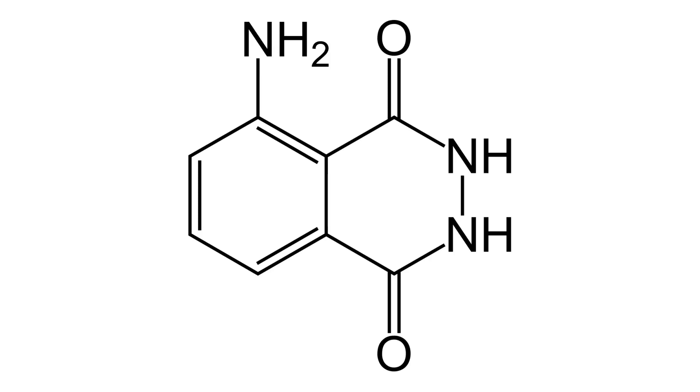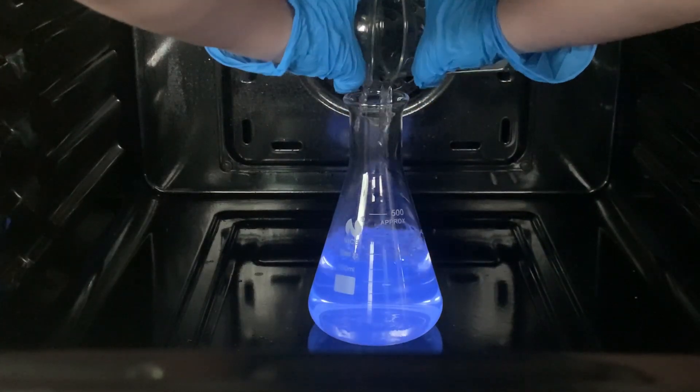In today's video, I will be making luminol, which is an interesting molecule as it exhibits chemiluminescence.